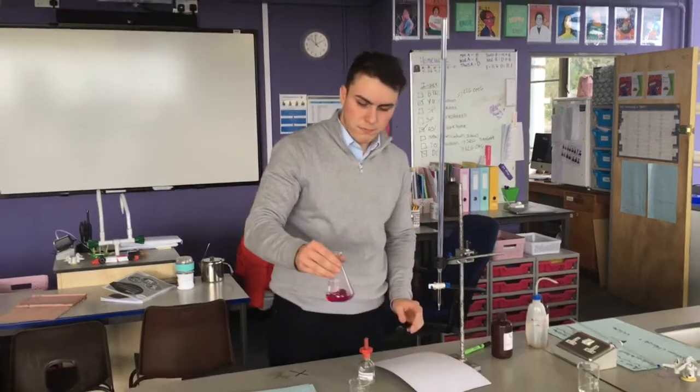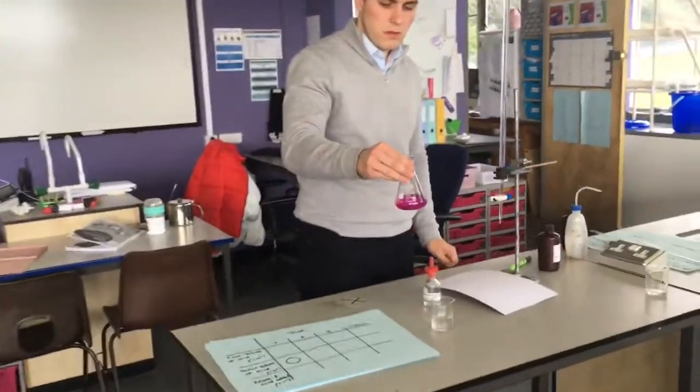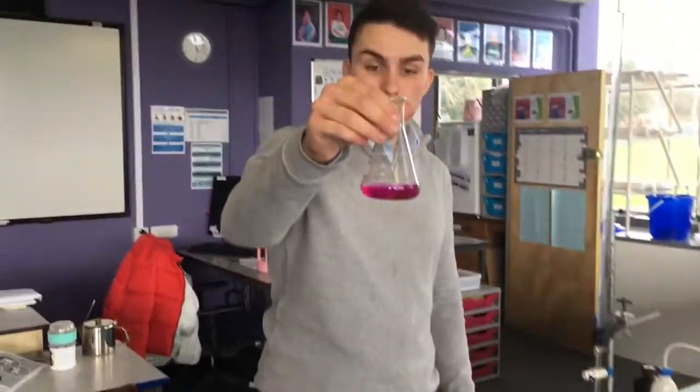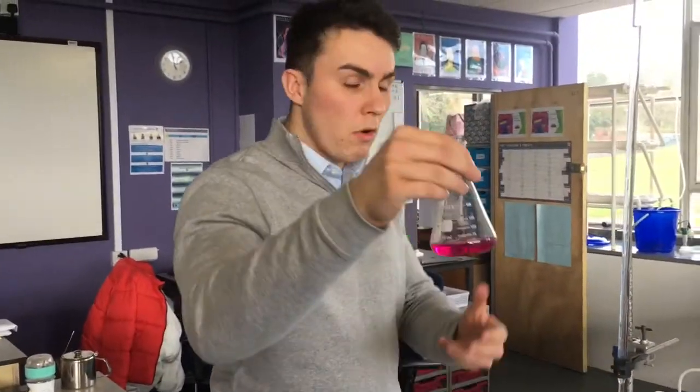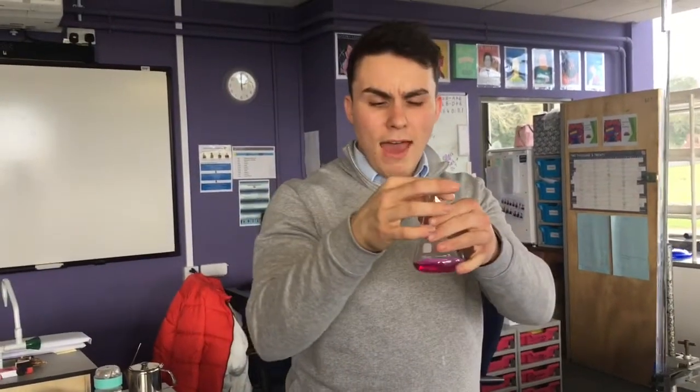I'm going to give it a swirl. That's turned pink because that's the base now in there — at the moment my indicator is showing me everything in there is a base.